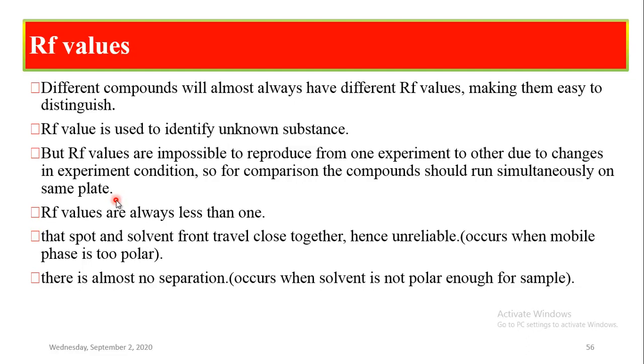RF values are always less than 1, as I have already told you, because the distance traveled by the solvent front is always greater than the distance traveled by the solute. So basically it is a ratio, and it is not greater than 1.